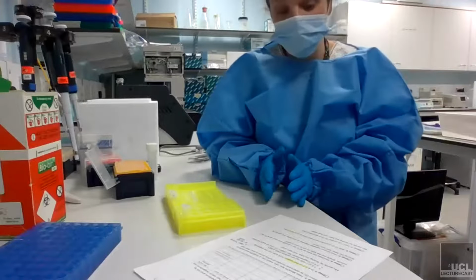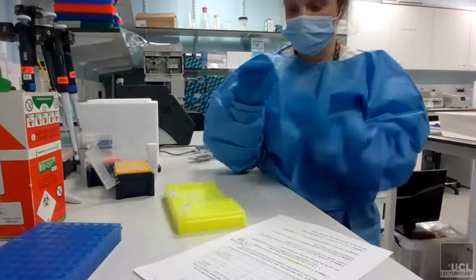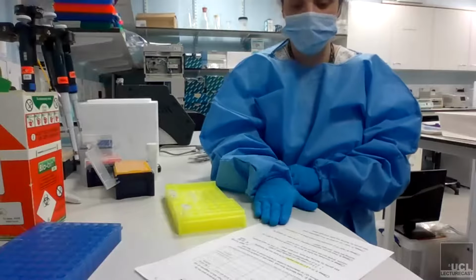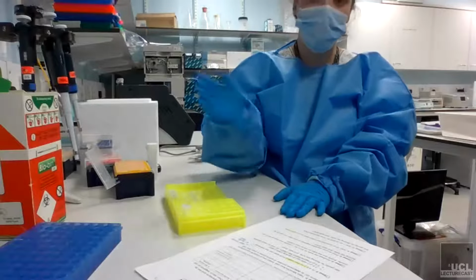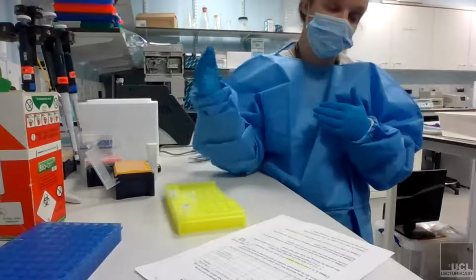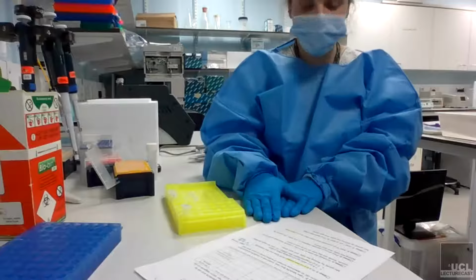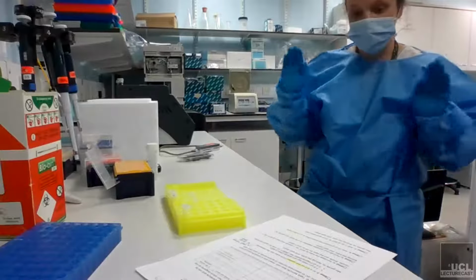The other thing that you also need to do is check the size, about 30 kb. Your DNA needs to be a certain size because Oxford Nanopore sequencing requires long read DNA. With this version of the protocol anyway, with different kits it might be different, it requires that you have about 30 kb or more as your average size. You can either use gel electrophoresis to check the size, or the Bioanalyzer, or a TapeStation. Those are two quite important requirements for this specific kit. You also need clean DNA, because salts and things can block the pores on the flow cell. Right, so now we know what we need.